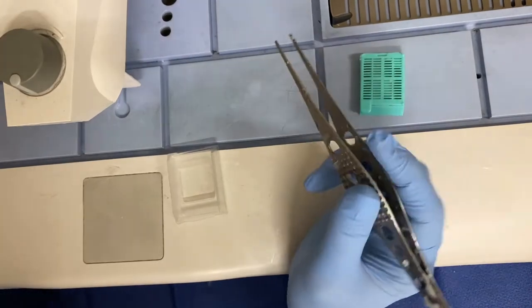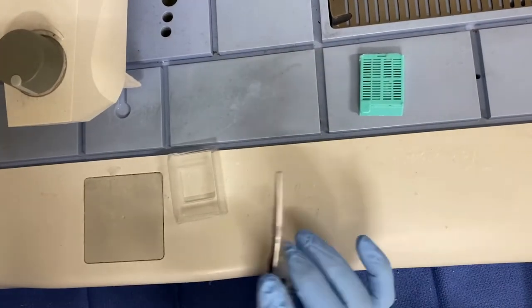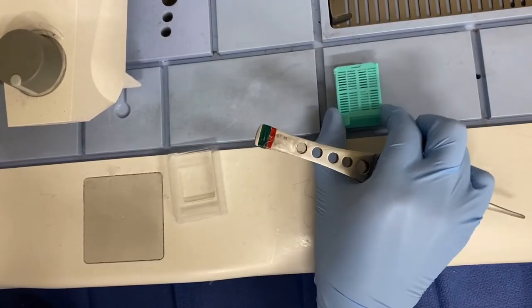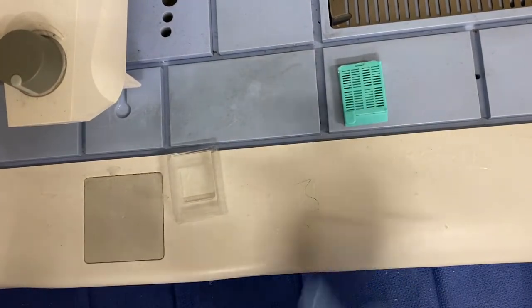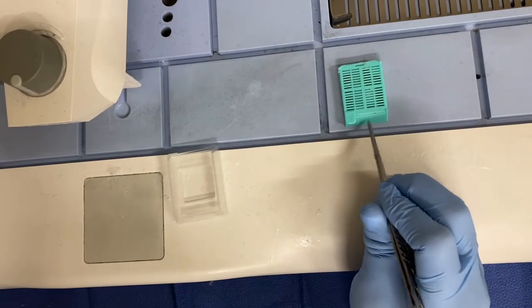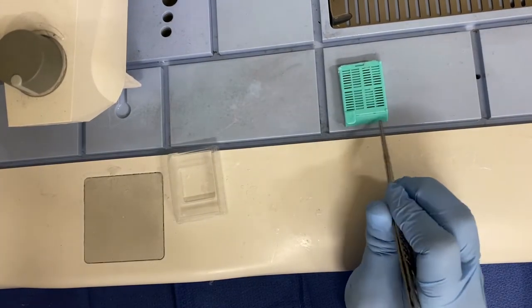We're going to walk you through the steps of embedding. We're going to start with just one single cassette at a time—that's really important to help with any mix-up. We want to make sure that we verify our patient information, which is printed here with our case number.